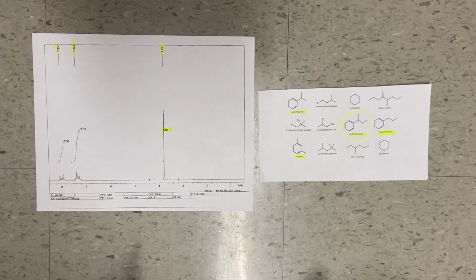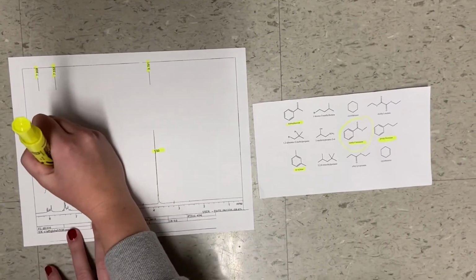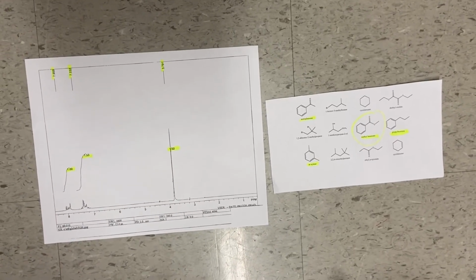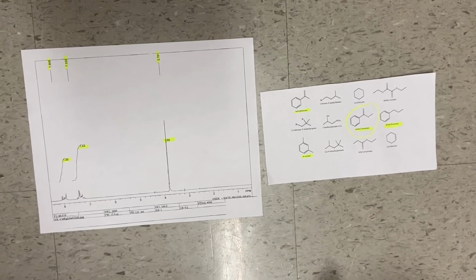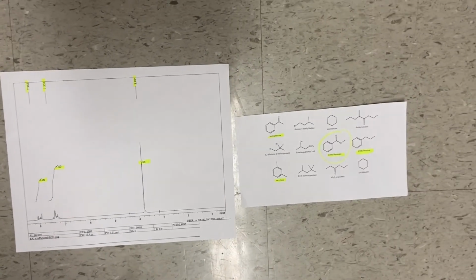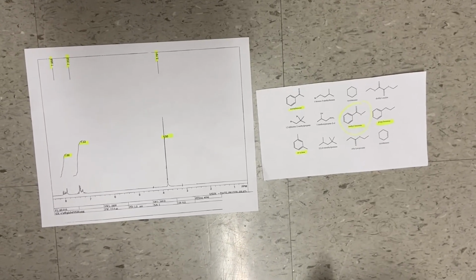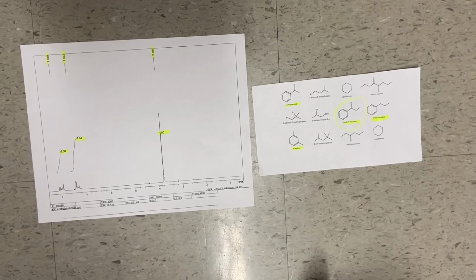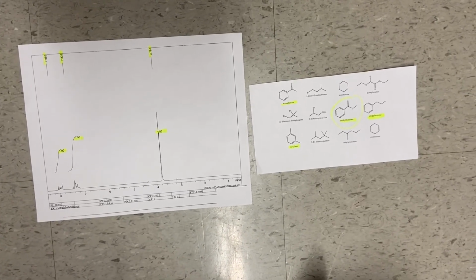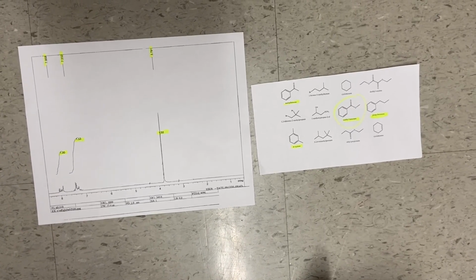The integration values on the aromatic ring are 3 and 2, and both have a splitting pattern of a multiplet, meaning there are neighboring carbons with hydrogens. The peak present at 3.791 ppm is a singlet, showing there are no neighboring carbons with hydrogens. After viewing all of this information, the unknown can be narrowed down to methylbenzoate.